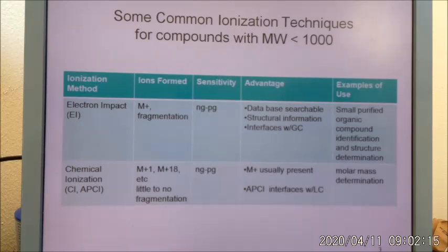Then we vaporize and solvate our substance of interest. It is protonated not because I'm stripping an electron, but because it's combining with a charged solvent molecule. So under acidic conditions, that's how you get your molecular ion plus 1. If you have protonated water, then that's how you get the M plus 18. You don't get very much fragmentation at all. It's nanogram to picogram amounts, so it's sensitive again. And usually you see your molecular ion, you don't lose it.